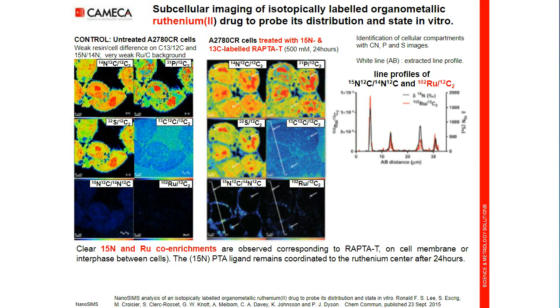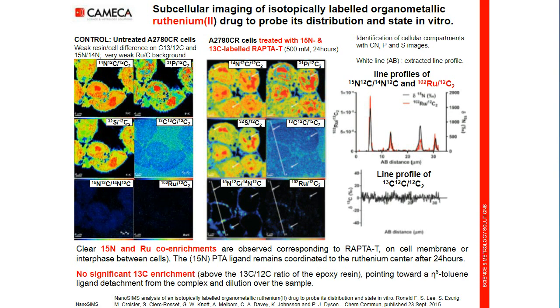And second observation, taken from the line scan on the carbon-13 enrichment, there is no significant carbon-13 enrichment. So that points toward the toluene ligand detachment from the complex and dilution over the sample.